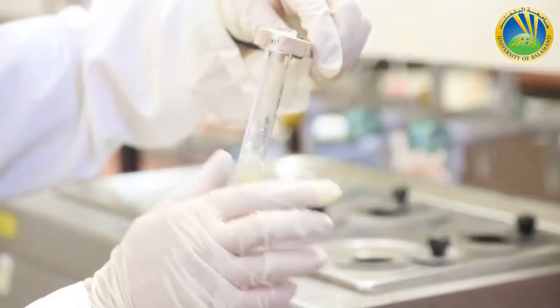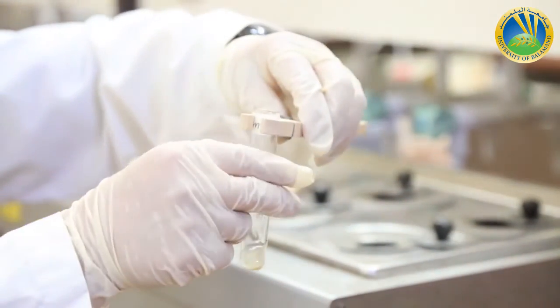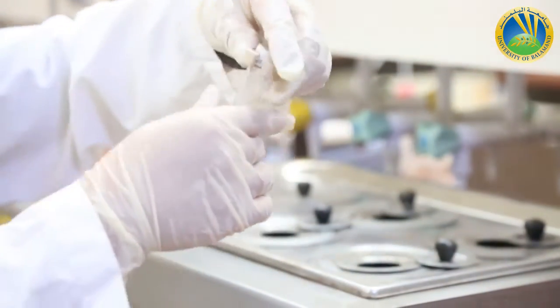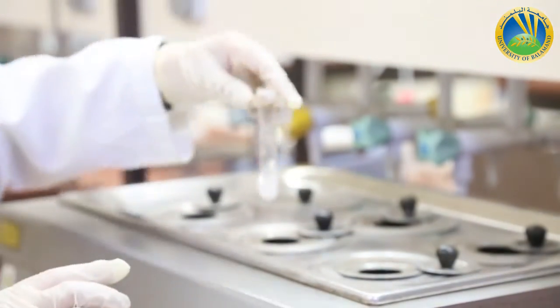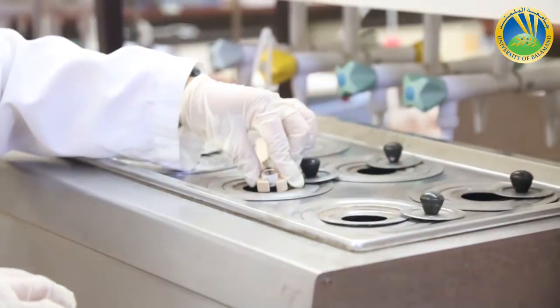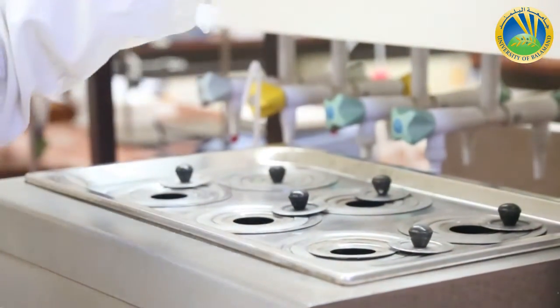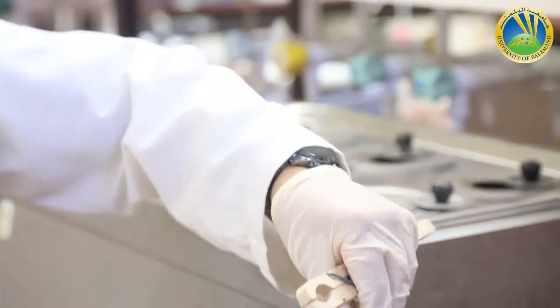Anthracene did not dissolve at 50 degrees inside petroleum ether. Sodium benzoate did not dissolve, but let me check it again. It did not dissolve. Sodium benzoate did not dissolve even at hot.